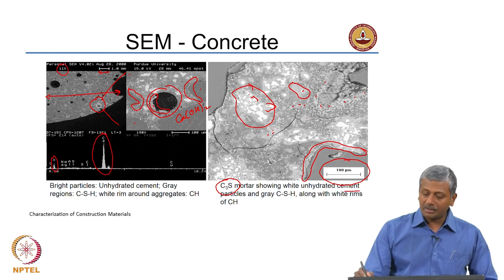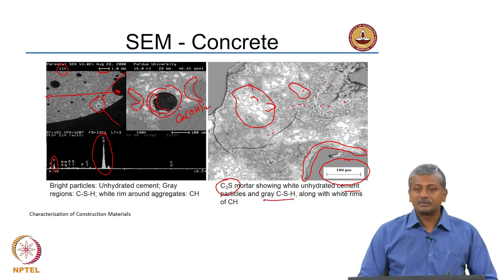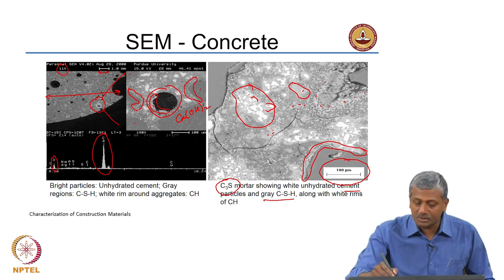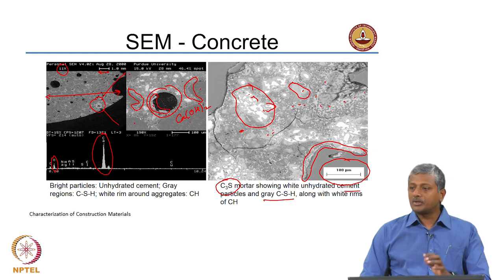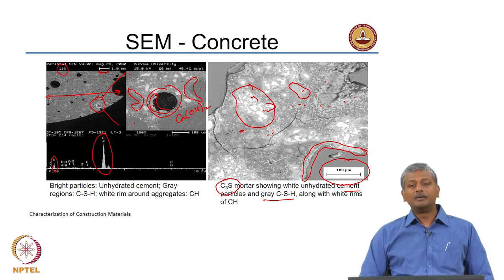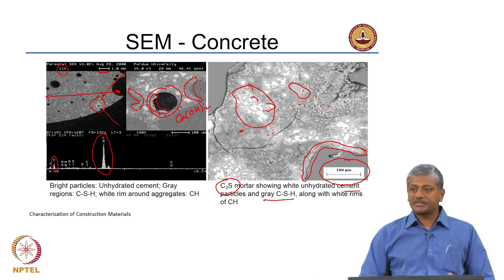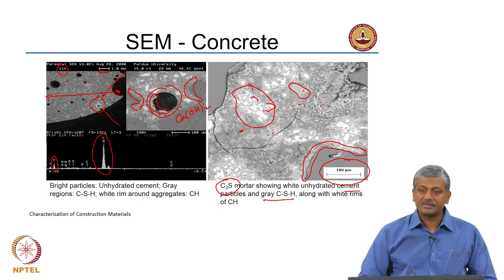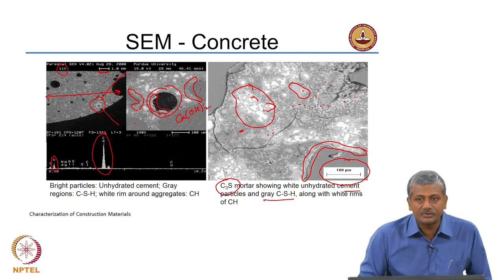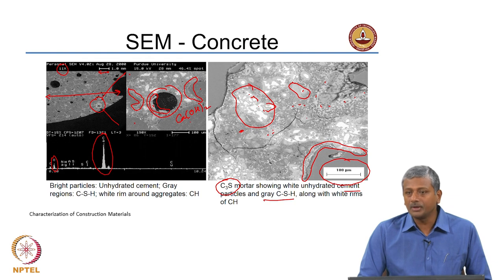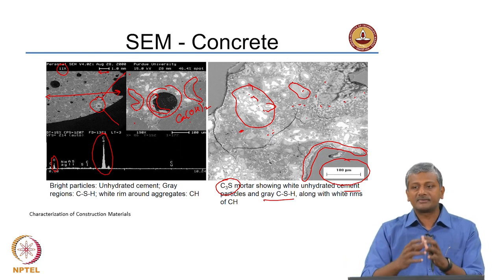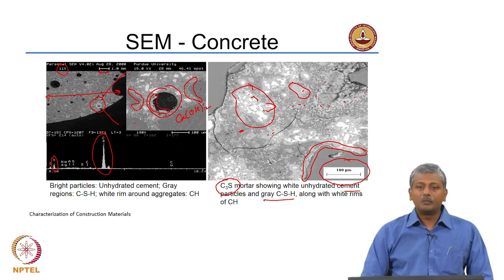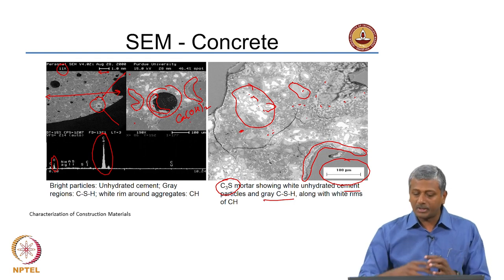You can see the cement particles which are white, and different grey levels of the inner CSH and the outer CSH. The outer CSH appears darker because it has much greater porosity. Inner CSH is denser because it is forming right on the surface of your C3S. Outer CSH is formed by dissolution of the cementitious particles, and in that process a lot of porosity is entrapped within the structure of the outer CSH, whereas inner CSH is much denser.